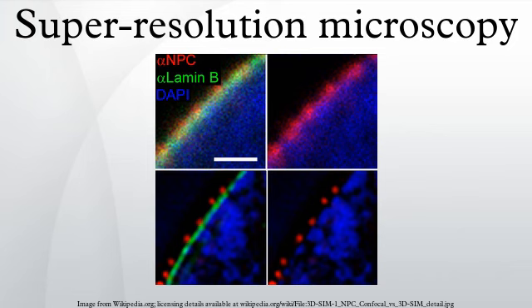By scanning this focal spot, one retrieves the image. The FWHM of the PSF of the excitation focal spot can theoretically be compressed to an arbitrary width by raising the intensity of the STED pulse, according to the equation. ΔR is the lateral resolution, Δ is the FWHM of the diffraction limited PSF, Imax is the peak intensity of the STED laser, and Is is the threshold intensity needed in order to achieve saturated emission depletion.